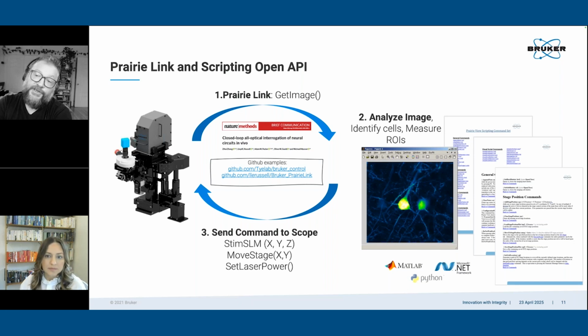If you have a lot of motion in Z, typically the best method for dealing with that is to, if you can, image a volume. So if you cover the whole area, post hoc volume registration is pretty good as well. You do sacrifice imaging speed the more slices you collect, but I used to do whole brain imaging in Drosophila, imaging across a couple hundred microns in X, Y, and Z. It's challenging to do that quickly, but if you capture everything, you can always fix the motion later.